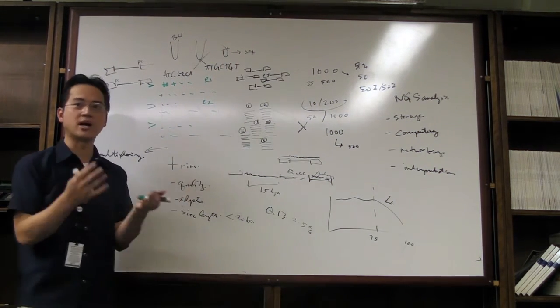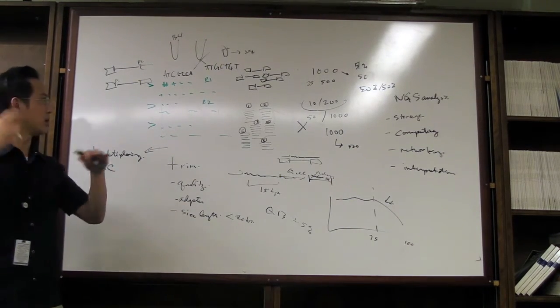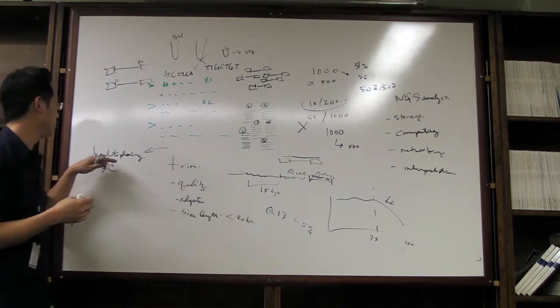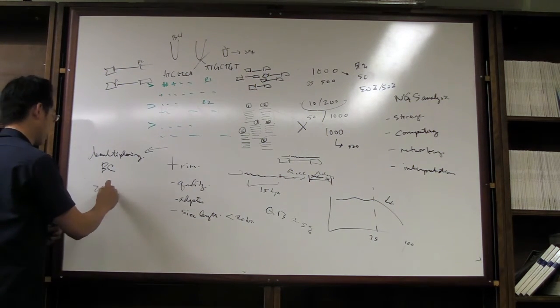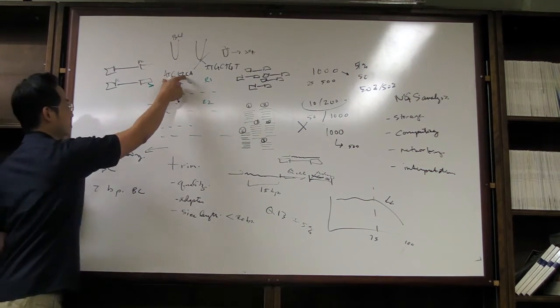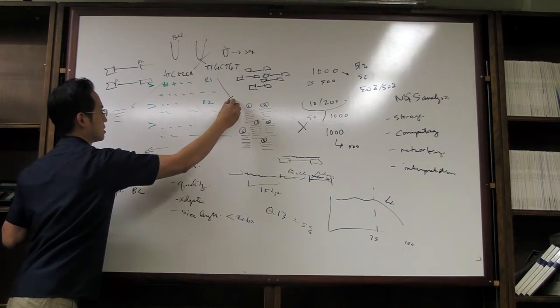So when you get the data back in that FASTQ file, everything is mumbo jumbo, right? You have some proportion of this, some of that. Hopefully it's half and half. And then you tell the computer to say, take the first 1, 2, 3, 4, 5, 6, 7. That's a weird one. A 7-base pair barcode. Read the first 7 bases, and if it belongs to this, please sort it into this group here. If it's that, please sort it into a second group here.